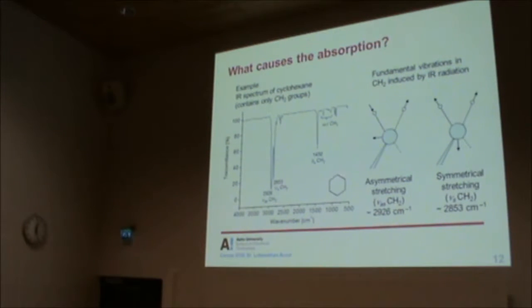And one thing that you can clearly observe is this intensity is higher when compared to this. This is even higher when compared to this. So there are going to be bonds that have specific vibrational modes that give higher intensity. The same bond will have vibrational modes that give lower intensity. Okay, so these higher and lower intensities are denoted by the terms strong, medium, and weak. For example, the CH2 stretch in this region, in infrared spectroscopy, is going to be a strong peak because it gives very high intensity.